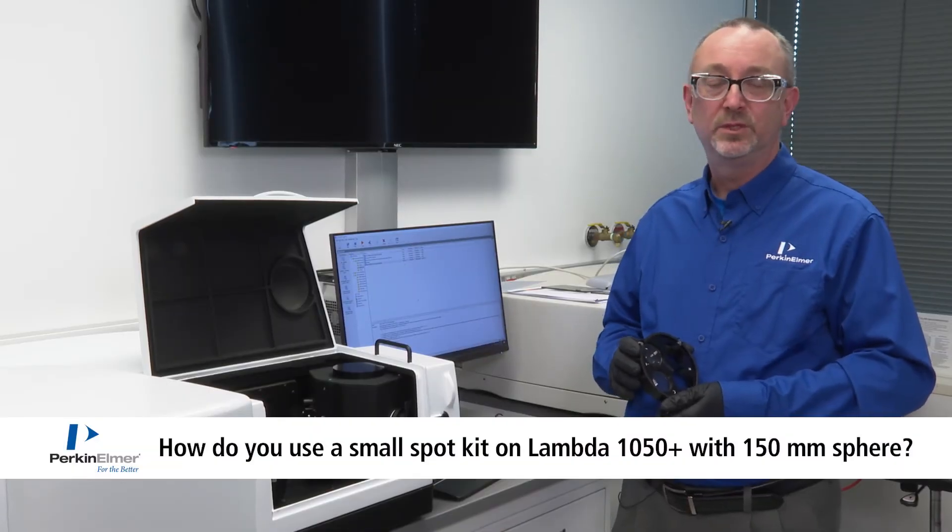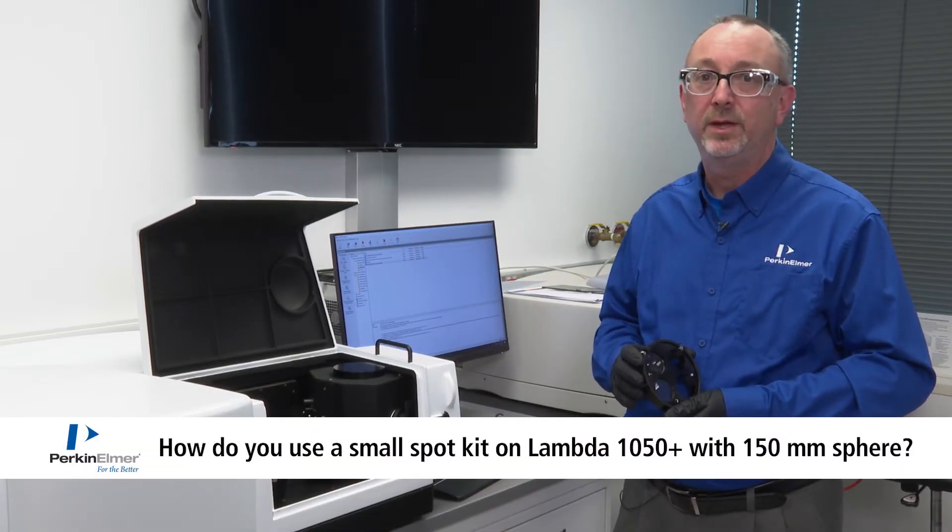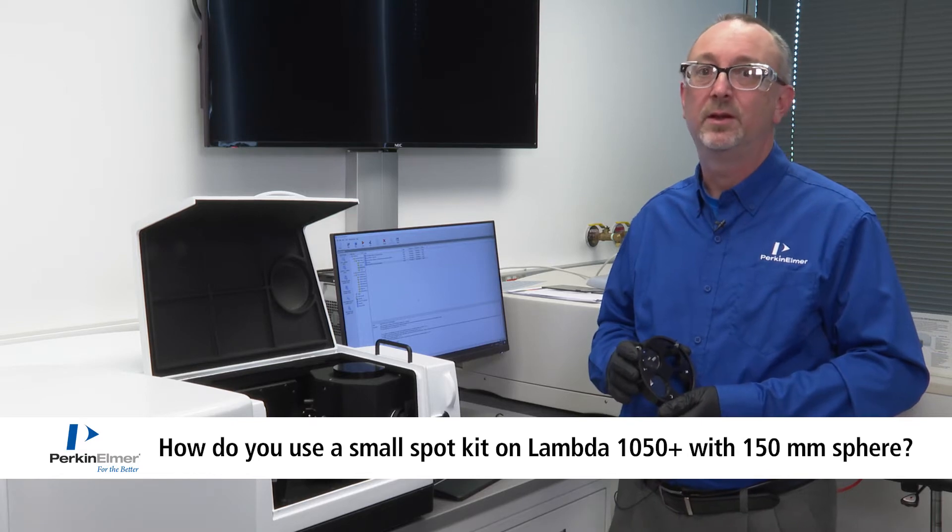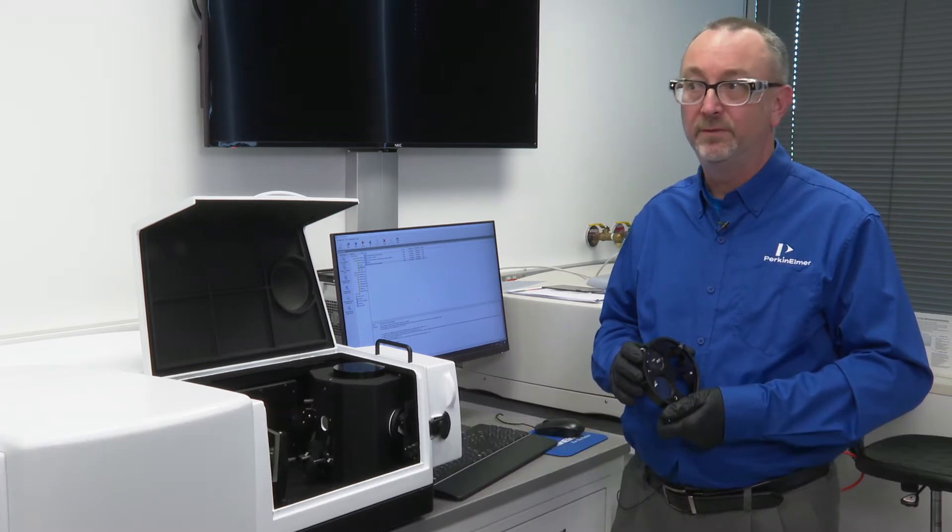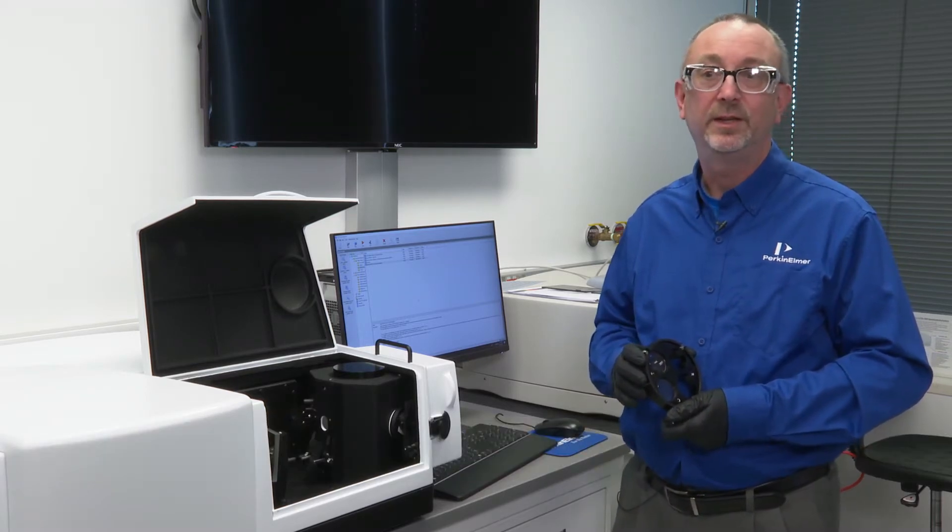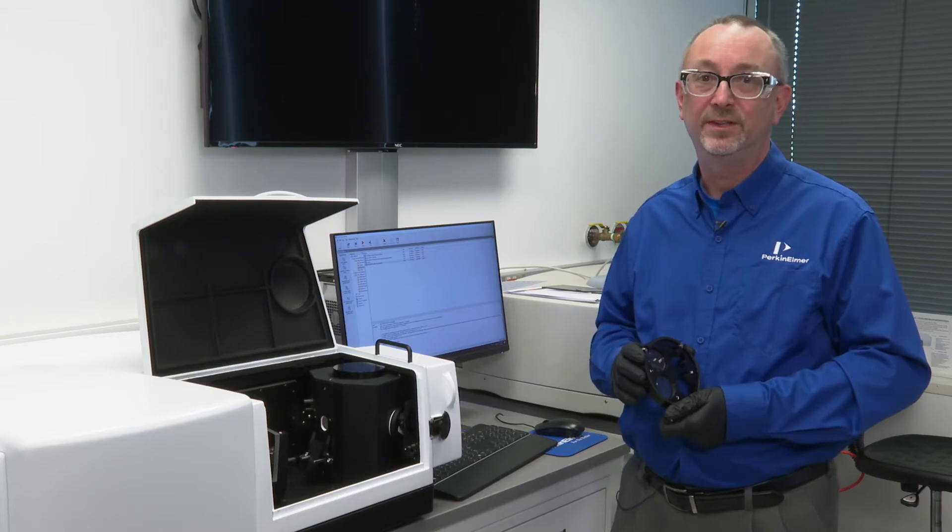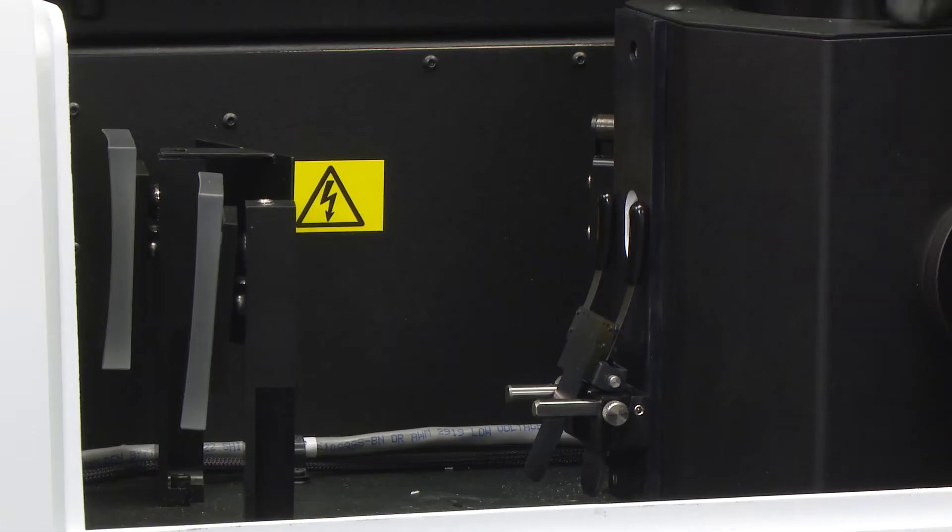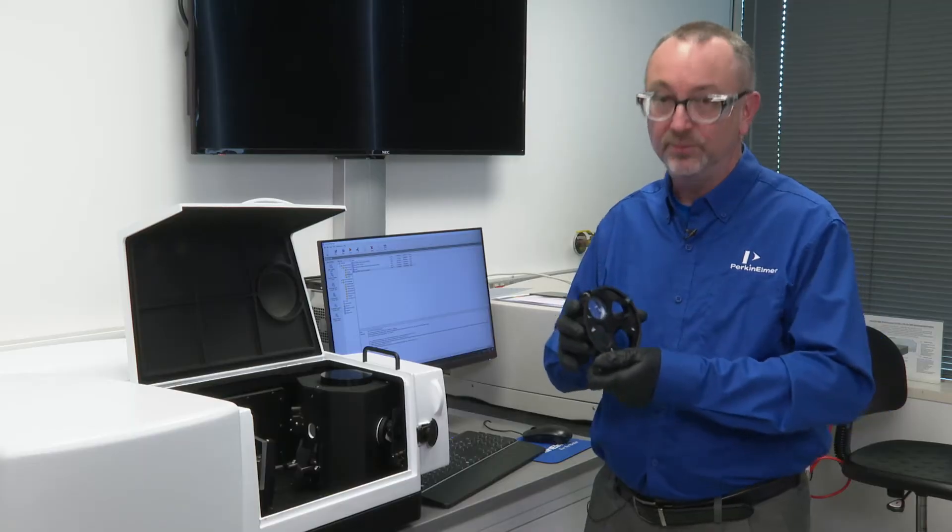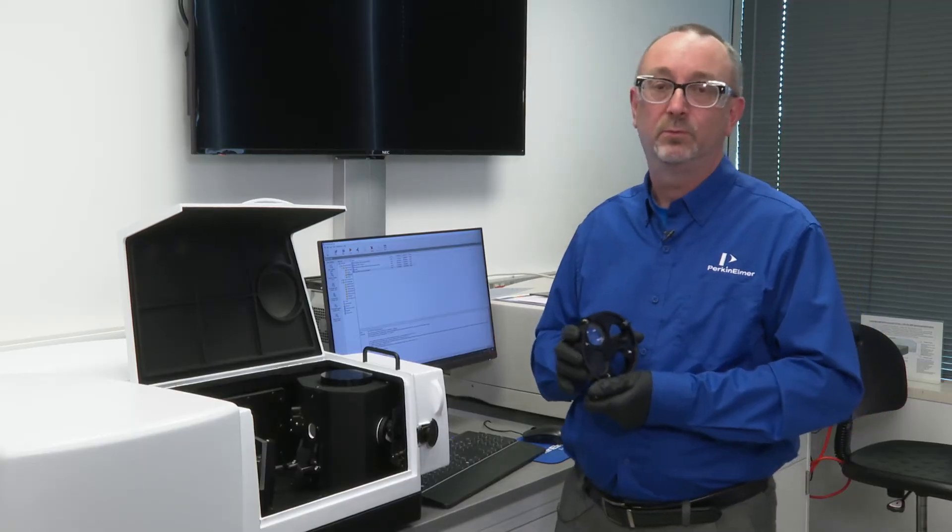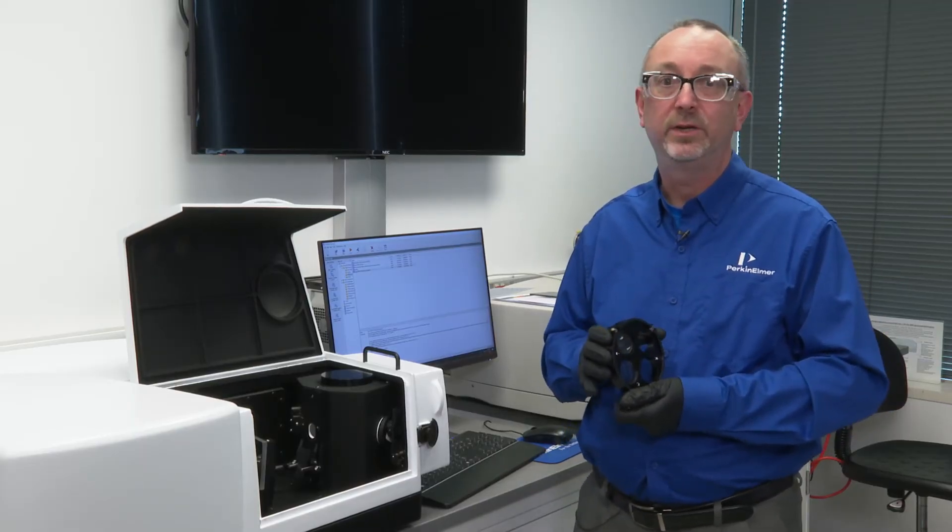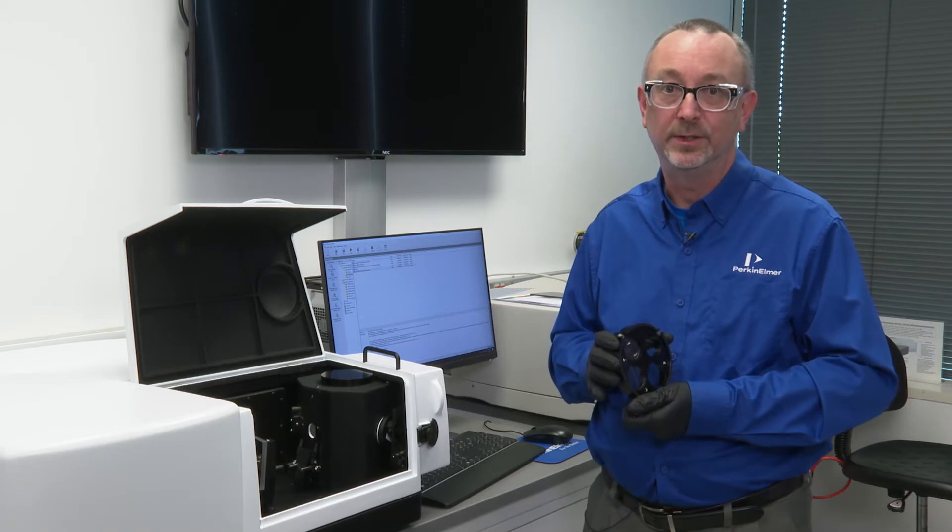So what is the small spot kit? Occasionally we have users ask us about analyzing very small samples, typically 3-4mm in diameter. The beam coming from the instrument is much larger than many samples. The samples that we are referring to here are about 3x4mm approximately.